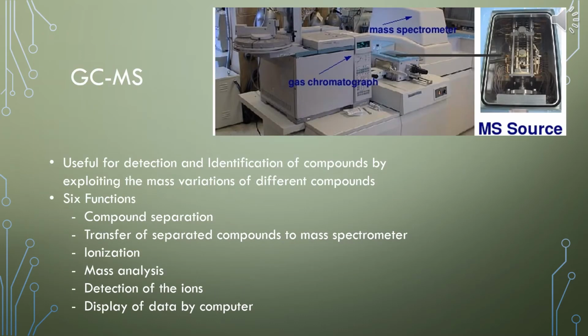GCMS, otherwise known as gas chromatography mass spectroscopy, is a common analytical method. To initiate the GCMS process, a syringe with the desired compound is placed in the GC column, also known as the stationary phase. The column is then heated, which will cause the compounds to move and will make the sample vaporize and mix with the gas mobile phase.